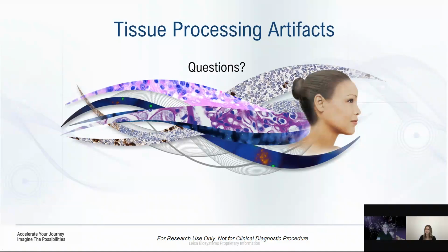It's going to be a little bit different in tone and hue, depending on if you used Harris versus Weigert's. Another thing too is if your eosin is not fresh, or if it's not at the right pH, that can affect the tissue picking up that stain and keeping it. Or if you have an alcohol following the eosin that is a little bit too diluted with water, because you're carrying over those racks, you can carry water over. And if you allow that to sit in there, water will leach out the eosin.